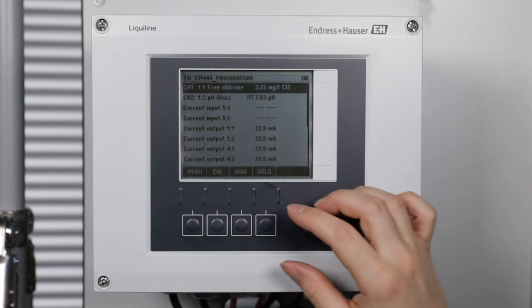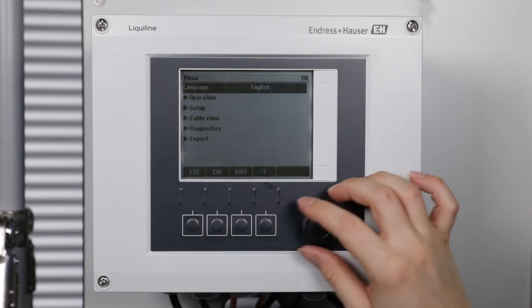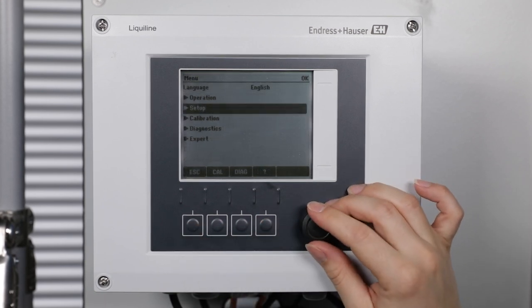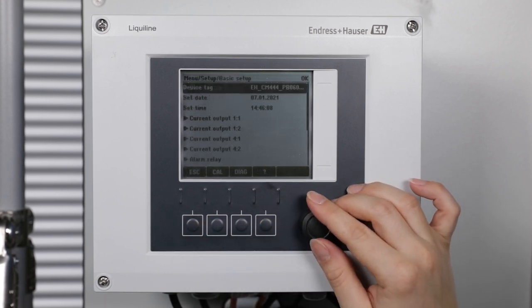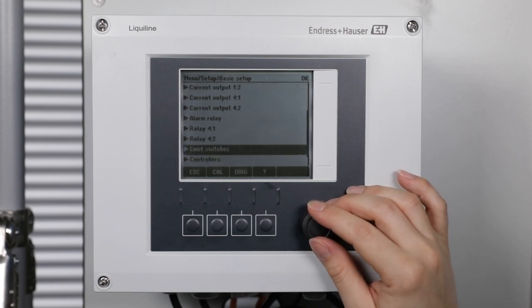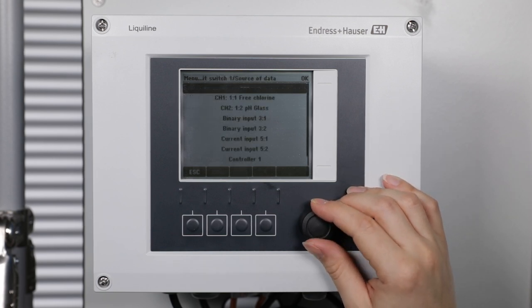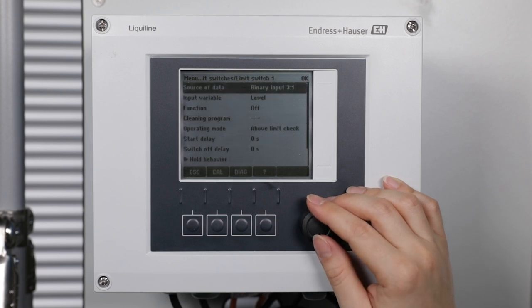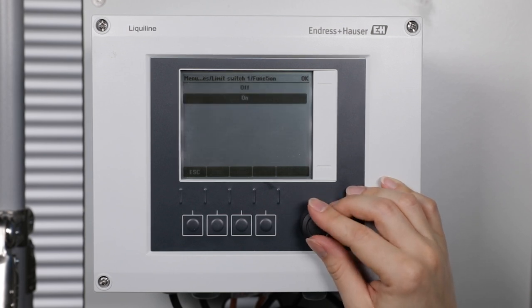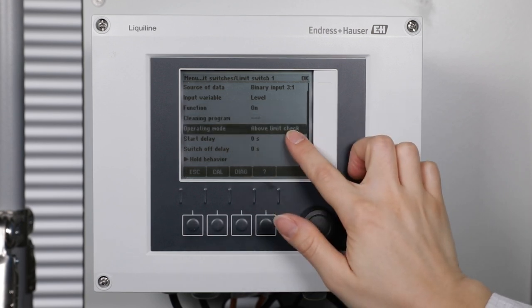Then assign a limit connected to the binary input in menu, setup, basic setup, limit switches, limit switch 1 and select the options: binary input as source of data, function on and operating mode above limit check.